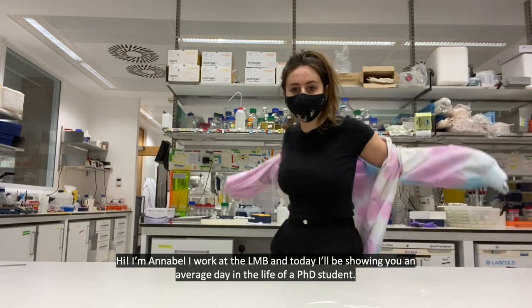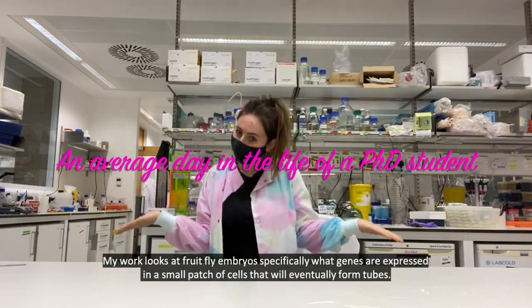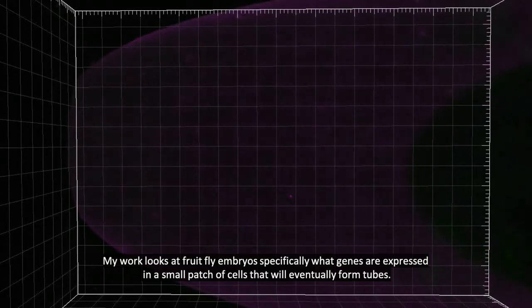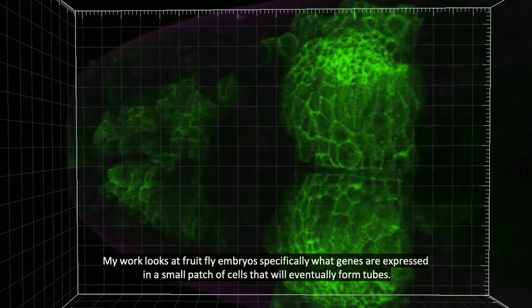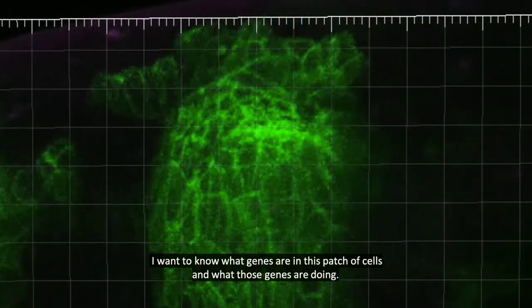Hi, I'm Annabelle. I work at the LMB and today I'll be showing you an average day in the life of a PhD student. My work looks at fruit fly embryos, specifically what genes are expressed in a small patch of cells that will eventually form tubes. I want to know what genes are in this patch of cells and what those genes are doing.